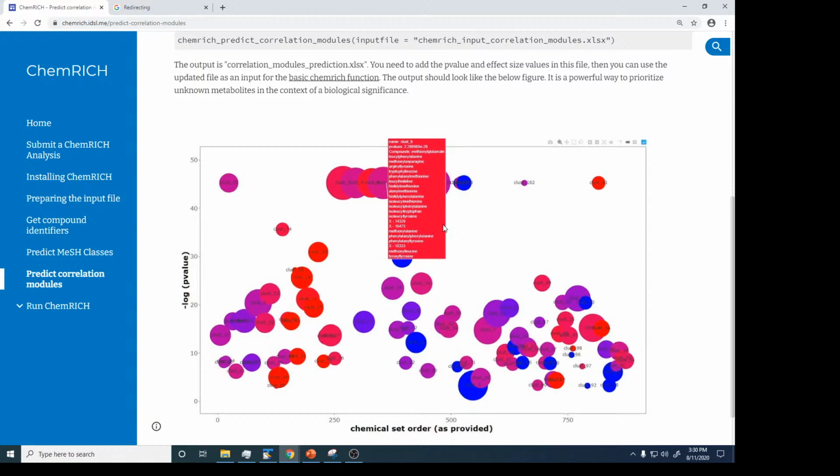They were part of the most significant sets, and they're also similar to other chemicals. They are similar, like dipeptide in this case. So most probably these are dipeptides. Somebody just needs to look at their MSMS spectra and figure out what the amino acid composition of these dipeptides is. Now, as you can see, we have many clusters, and that way it becomes a powerful approach. In my opinion, it's a really powerful approach for how we can prioritize or rank unknown metabolites in different sets.